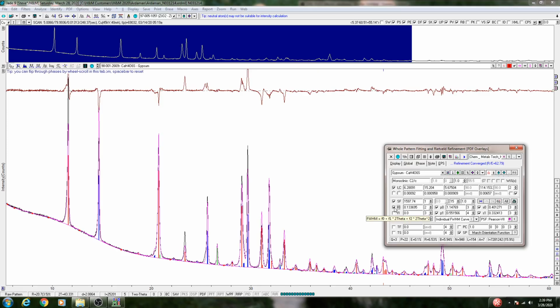All right, you can decide how far you want to take this model, if you will. In general, for phases that have very low quantities, say 10% or less, you generally want to just make it constant across the entire pattern because the minor peaks are too small to really properly fit. If you're above 10% or a major phase, you generally will want to refine F1 and F2 because the peak breadth will follow this relationship across the pattern.